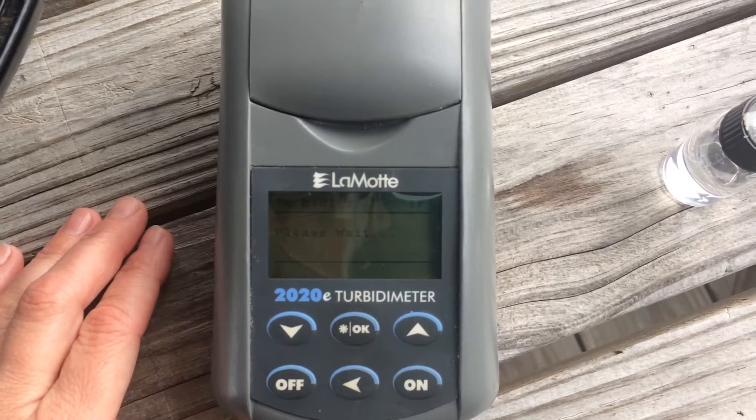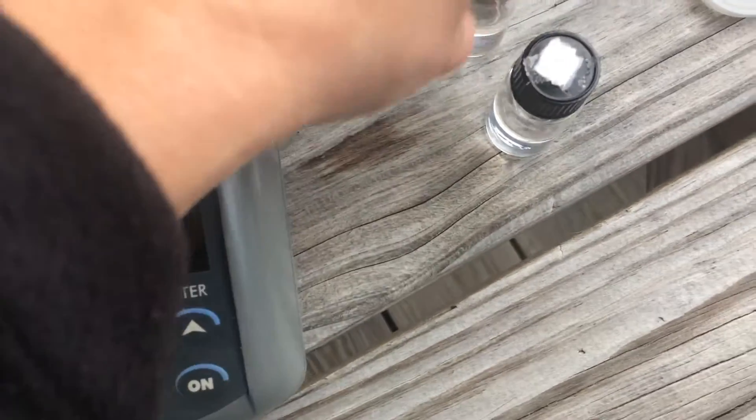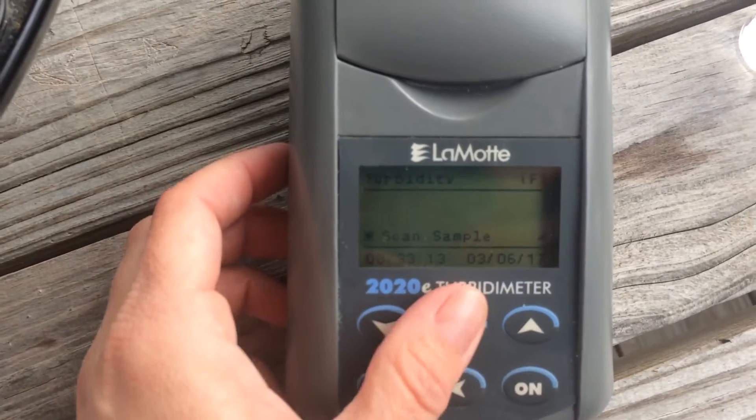It says please wait. Now it says scan sample. So take the zero out. For calibrating, you use the ten as your sample. Hit scan, okay.